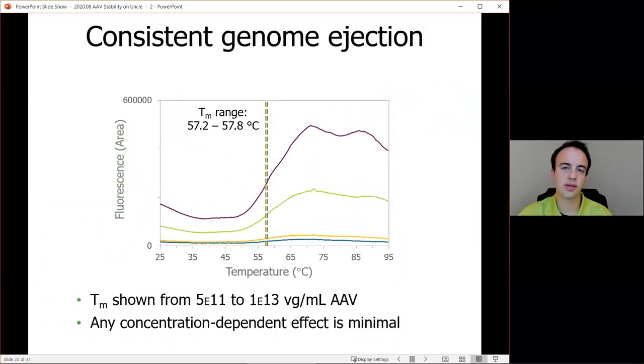If we want to compare that across different concentrations of AAV9, we can see here between 5E11 and 1E13 viral genomes per milliliter, a very nice consistent genome ejection behavior. And actually we can go up even higher to 1E14 viral genomes per milliliter, but doing so kind of compresses all the data. So any concentration dependent effect that we can see is minimal.